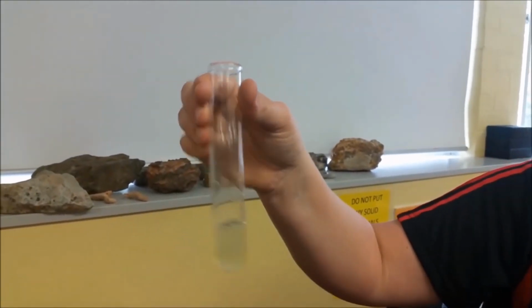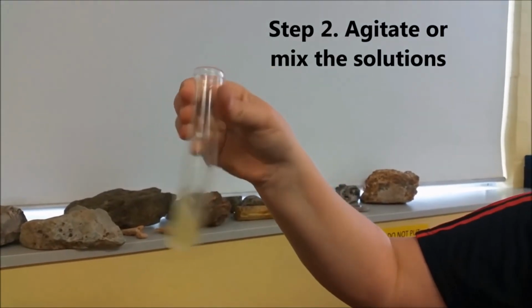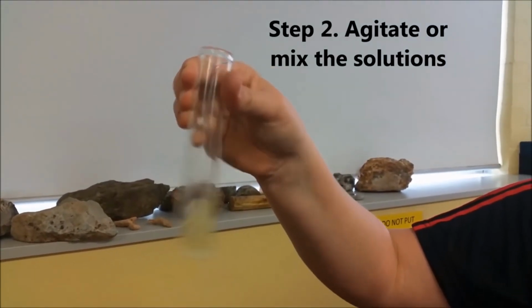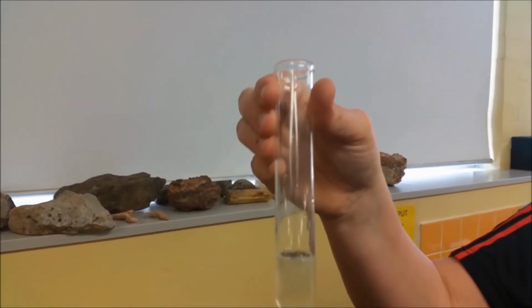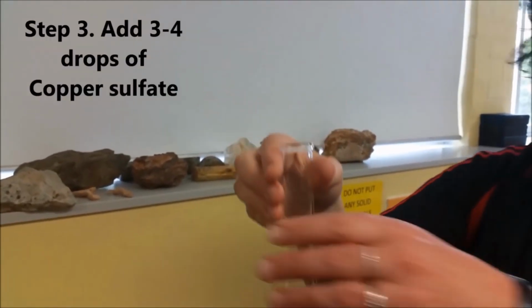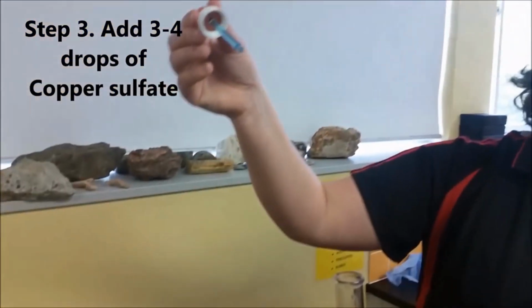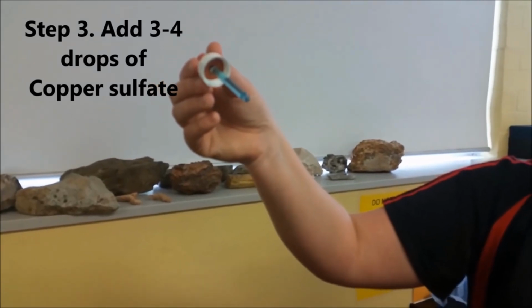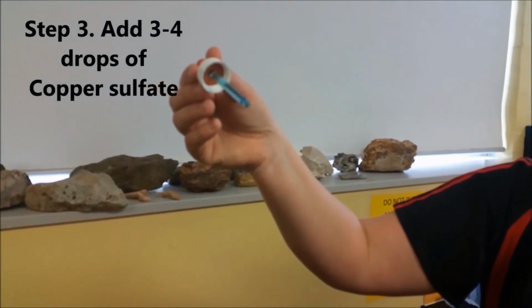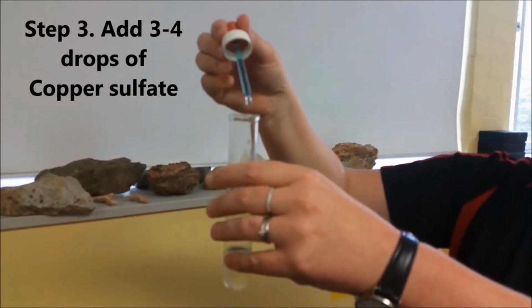I've added the sodium hydroxide. There is another part to it. You need to give it a bit of a shake. It's important that you agitate it between each addition of reagents. And then you add the second reagent, and it is important to add it in this order. The second reagent is copper sulfate. You guys have seen this before. It's that blue solution, but you only need about 3 or 4 drops of this. So the sodium hydroxide, 1 pipette full, mix, then 3 to 4 drops.